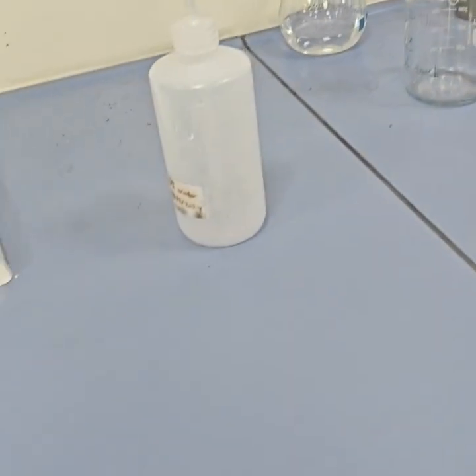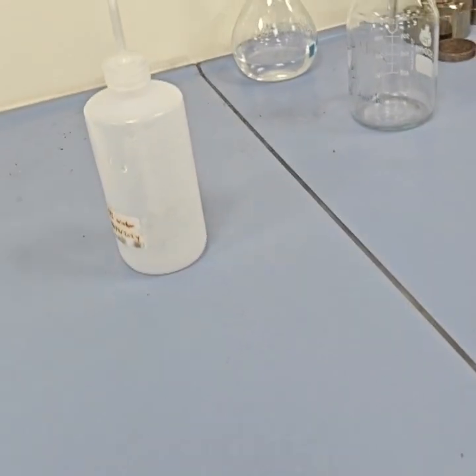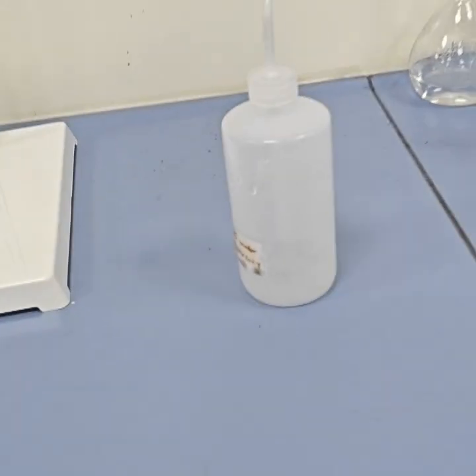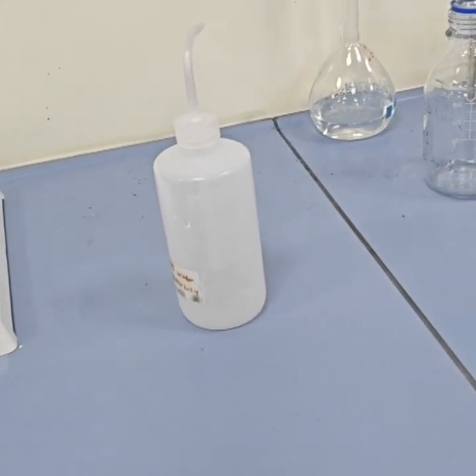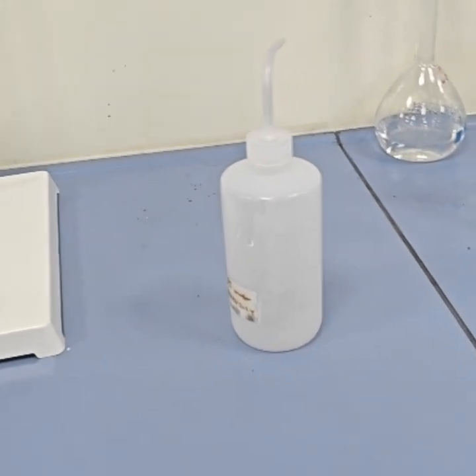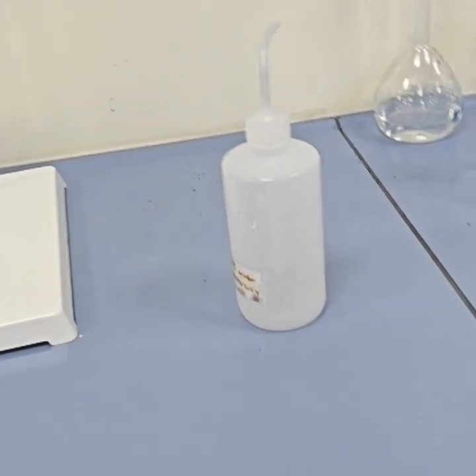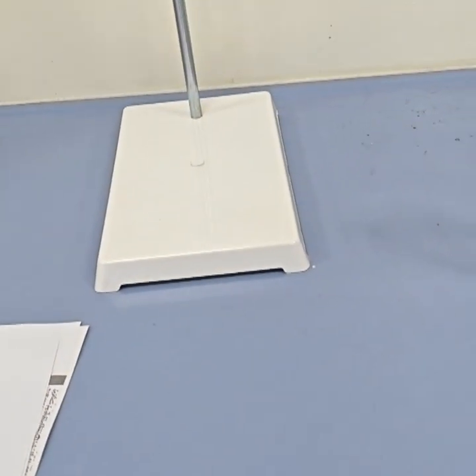Okay, and for volatiles, it could be a glass vial with Teflon septum, and you also have to add HCl so that there are no bubbles. It could be an acidic environment. Oil and grease: glass bottle with Teflon cap, add HCl or H2SO4. For all these, metals, phenols, volatile organics, oil and grease, and total organic carbon, the storage temperature is 4 degrees C. For metals, the storage time is 6 months, phenols 28 days, volatile organics 14 days, oil and grease 28 days, and total organic carbon 7 days.